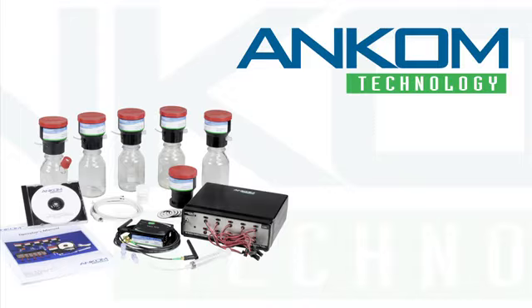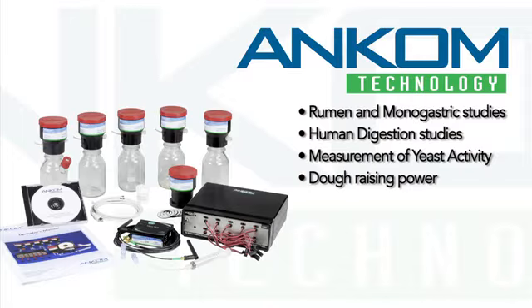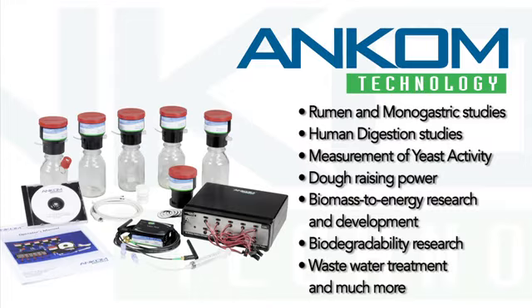To summarize, the ANKOM RF gas production system provides a low-cost and easy-to-use tool for monitoring and recording evolved gases in an anaerobic or aerobic environment. The RF system supports rumen and monogastric studies, human digestion studies, measurements of yeast activity, dough raising power, biomass to energy research and development, biodegradability research, wastewater treatment, and much more.